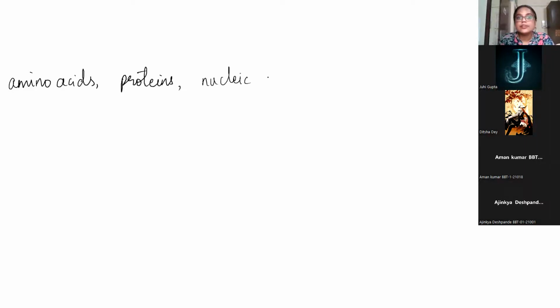Because our sample, since we are dealing with the bio aspect, the biochemistry, the biotechnology, we are always talking about the bio components. So what are the bio components? We know amino acids, proteins. So our material that we are going to analyze in the spectrophotometer may contain amino acids, proteins, nucleic acids like DNA, RNA, sugars, natural sugars, and other biomolecules.